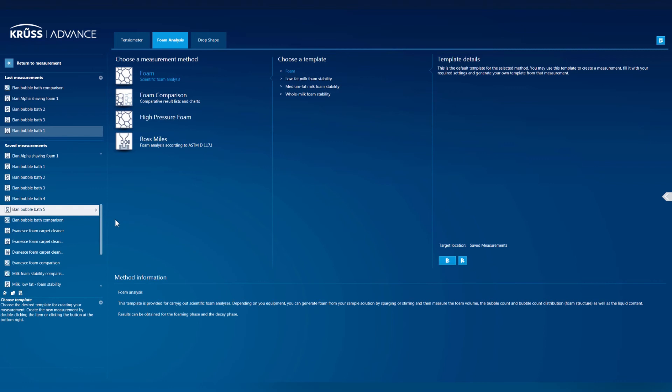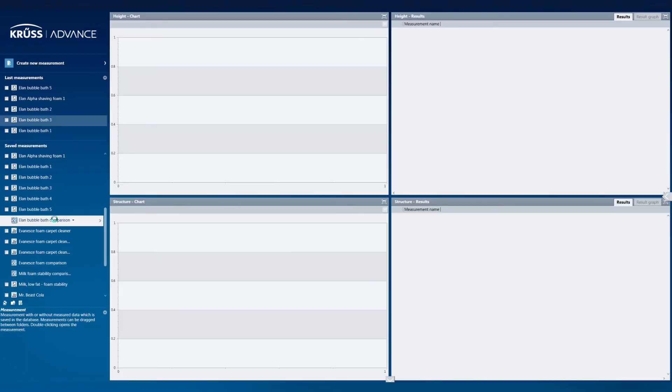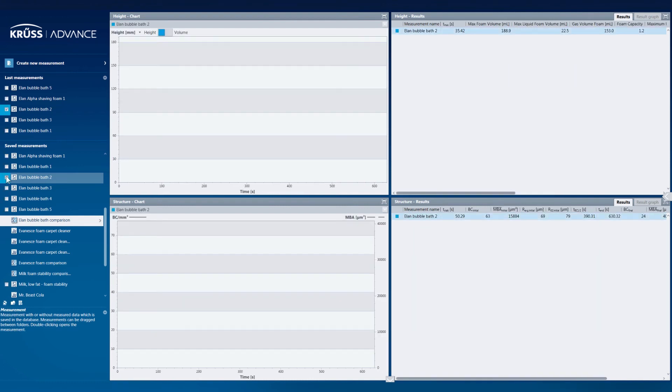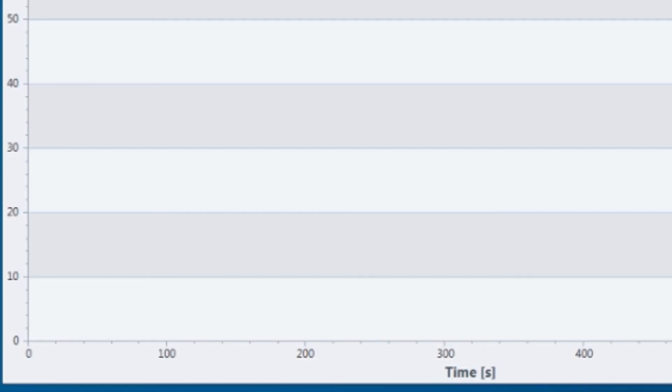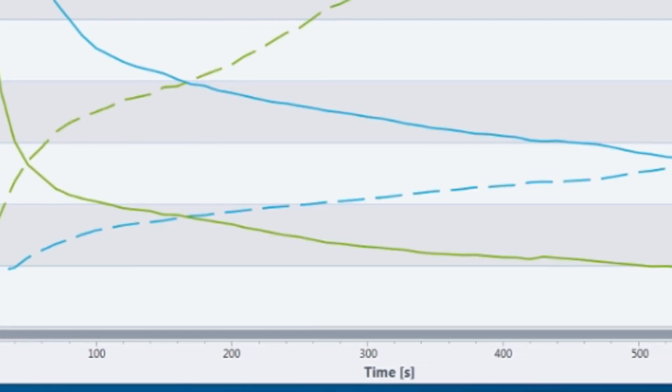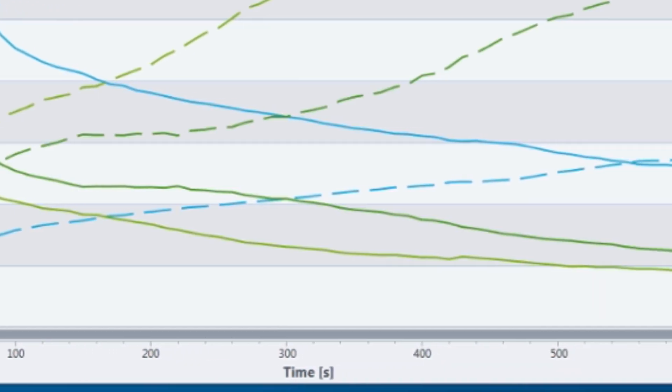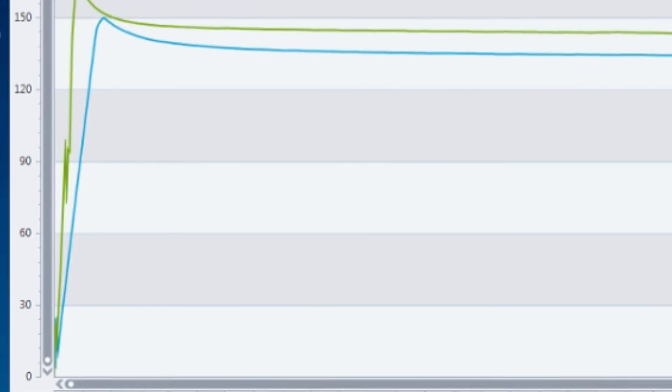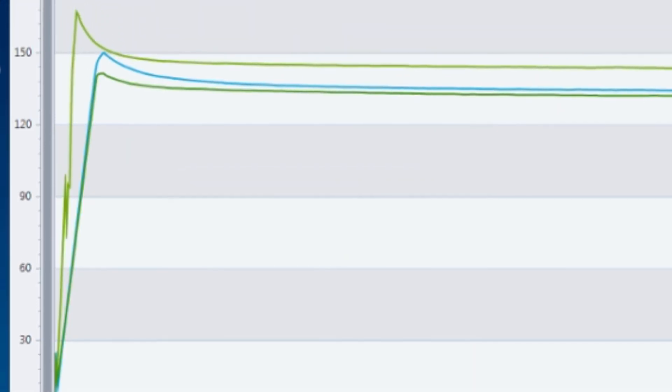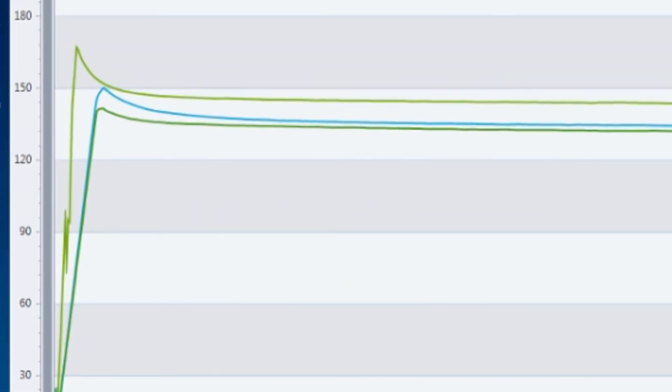Every different foam measurement you make can be compared directly with each other using our comparison tool. With this intuitive feature, you simply select which foam measurements to compare, and the software creates new graphs, charts, and tables with the data from the chosen measurements overlaid onto each other for easy comparison.